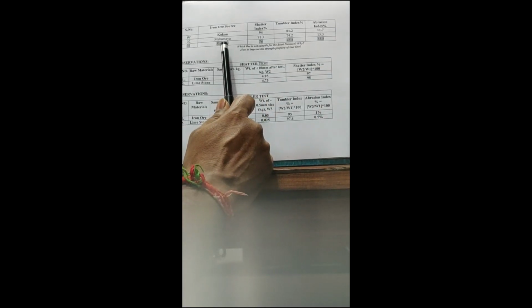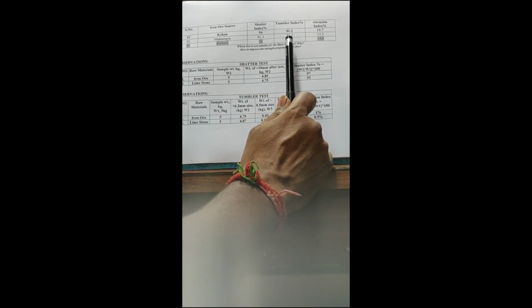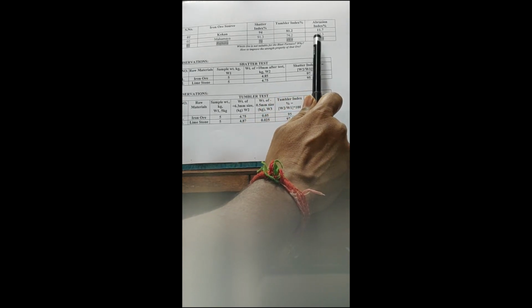But for Rajhara, the shatter index strength is less, the tumbler index is also less compared to Konkan and Mahamaya, and conversely the abrasion index is more, which is not required. It has a tendency to generate fines.